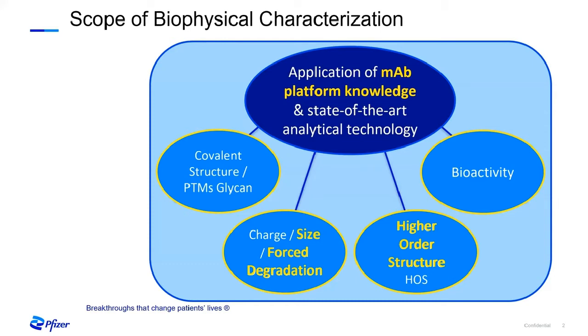I'm in a technology-focused group called mass spectrometry and biophysical characterization. We focus on confirming primary structure, glycosylation, disulfide bonds, degradation pathways, and the scope of the biophysical characterization are mainly to look at 2 quality attributes, protein aggregation and high-order structure for all the products of different modality.